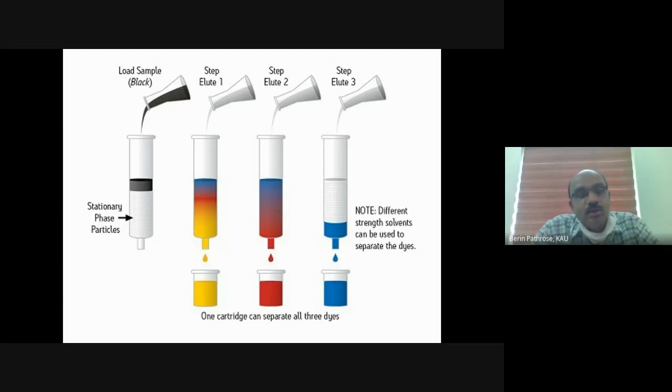Did you understand what I told? Have you gone through the column chromatography material I have given you for the laboratory techniques course? In that I have explained column chromatography. This is nothing but a kind of column chromatography. Are you clear about it? Solid phase extraction. Yes. Okay.